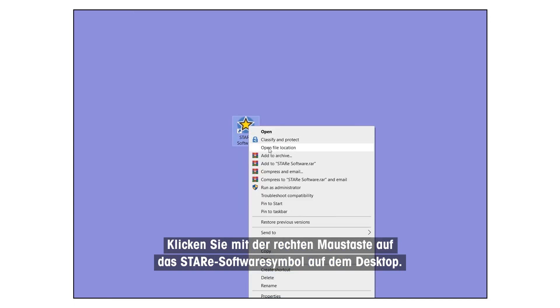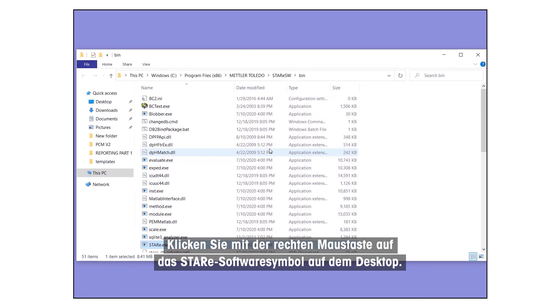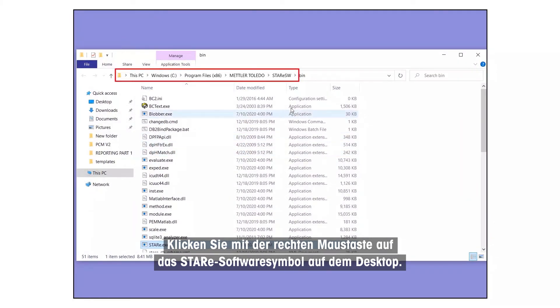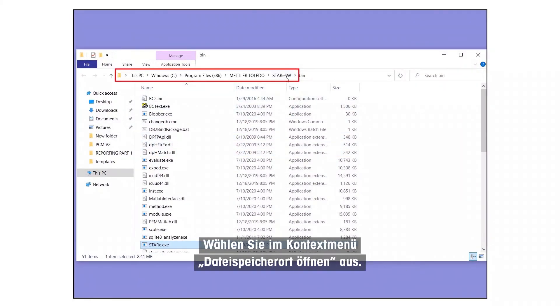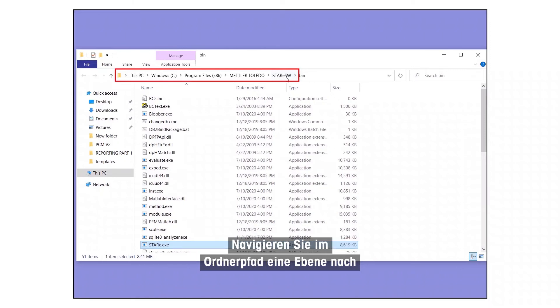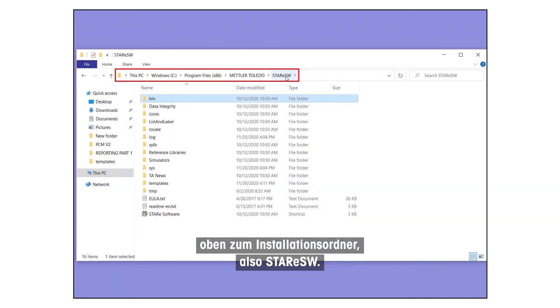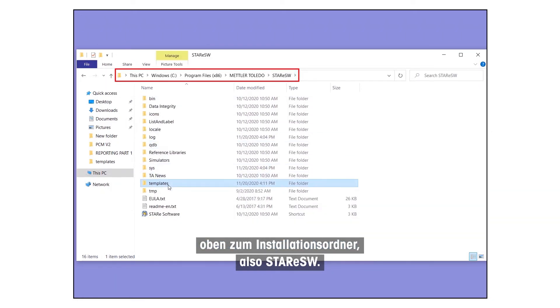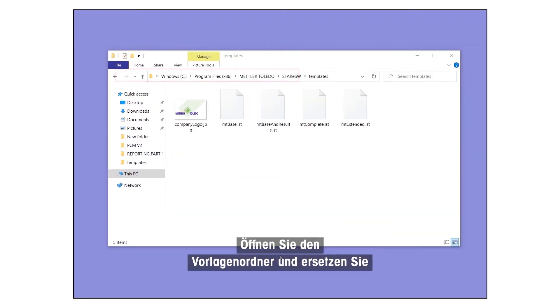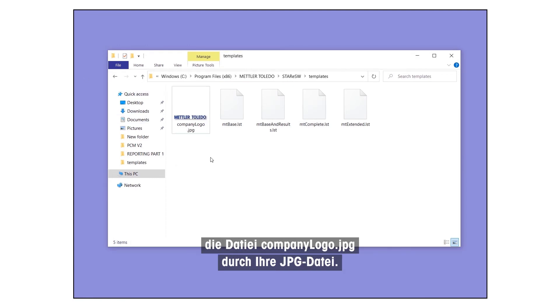Right-click the StarE Software icon on the Desktop. Select Open File Location from the Context menu. In the folder path, navigate one level up to the Installation folder, that is, StarE SW. Open the Templates folder and replace the file CompanyLogo.jpg with your JPG file.